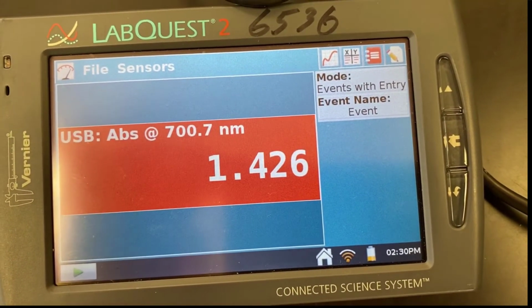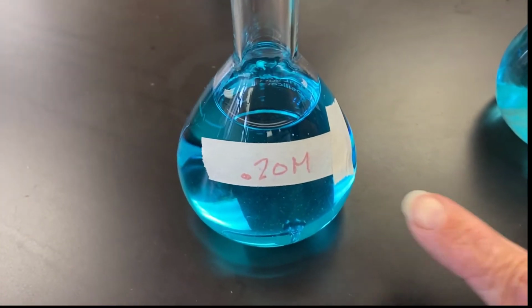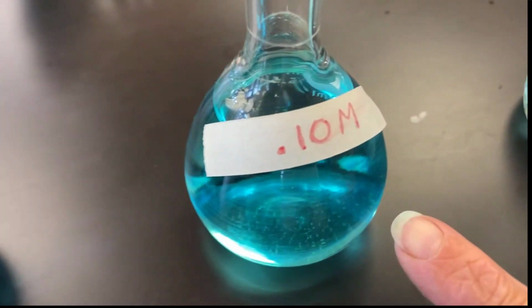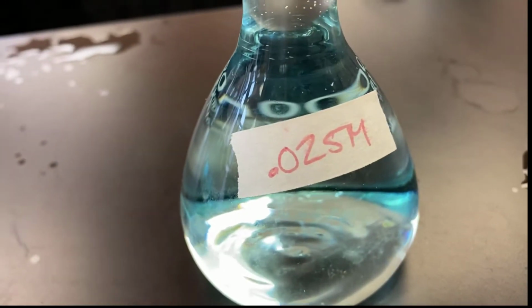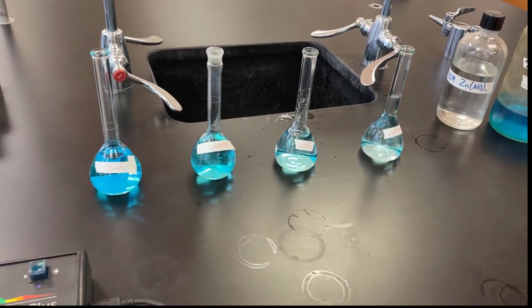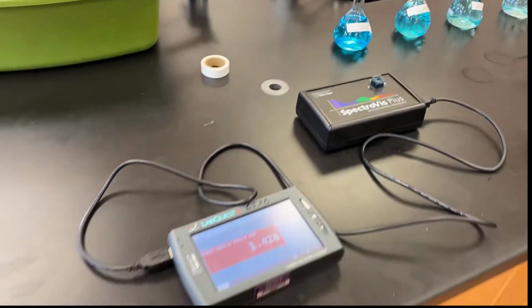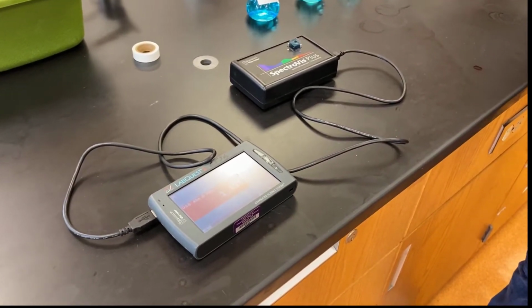If you look at the solutions that I've made here, you can see as the concentration goes down from 0.2 to 0.1, the solution becomes less blue. Even less blue if we go to 0.05, and barely blue if you go to 0.025. So as the concentration goes down, the color of the solution also goes down, so we would predict it would absorb less light. So we're going to actually look for a mathematical relationship.